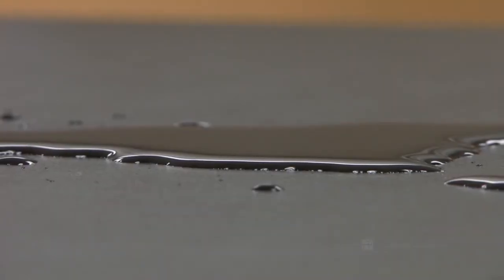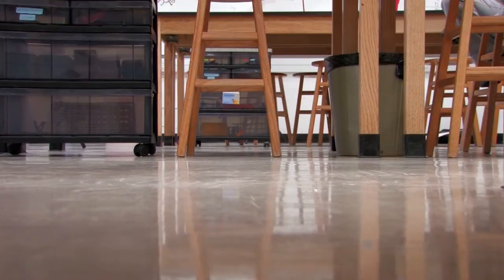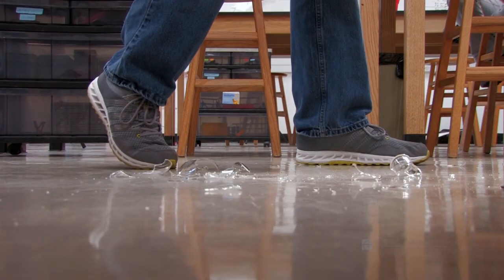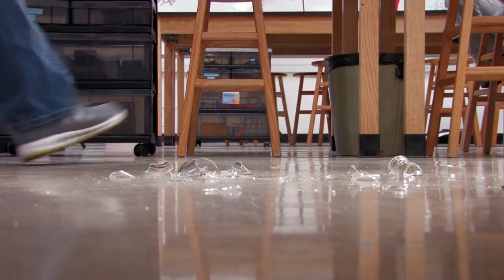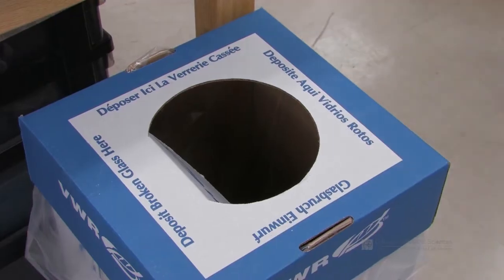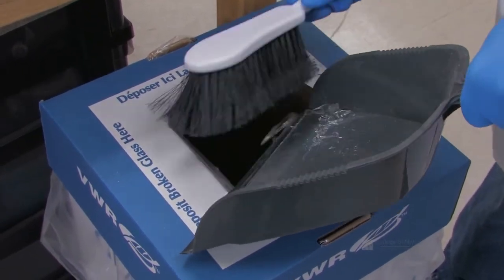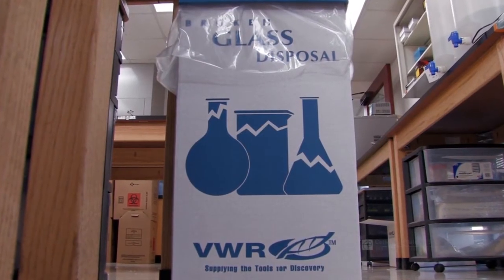A chemical spill is often accompanied by broken glassware. If glassware is broken in the lab, remain calm. If the broken glassware contained chemicals, inform your lab instructor of the incident to receive further instructions. If the glassware is clean, you may clean it up with a broom and a dustpan. Do not handle broken glassware by hand if possible. Place the broken glassware pieces into the glass waste container.